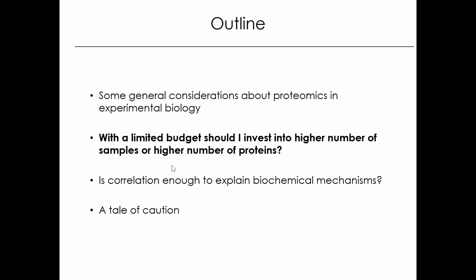Okay, now if we accept that our guiding light is such a data matrix, I would now like to discuss how, if we have a limited budget in the lab, which is probably the case for most of us, we should invest this money to generate a data set where we have maximized our chance to learn something and eventually write a paper.